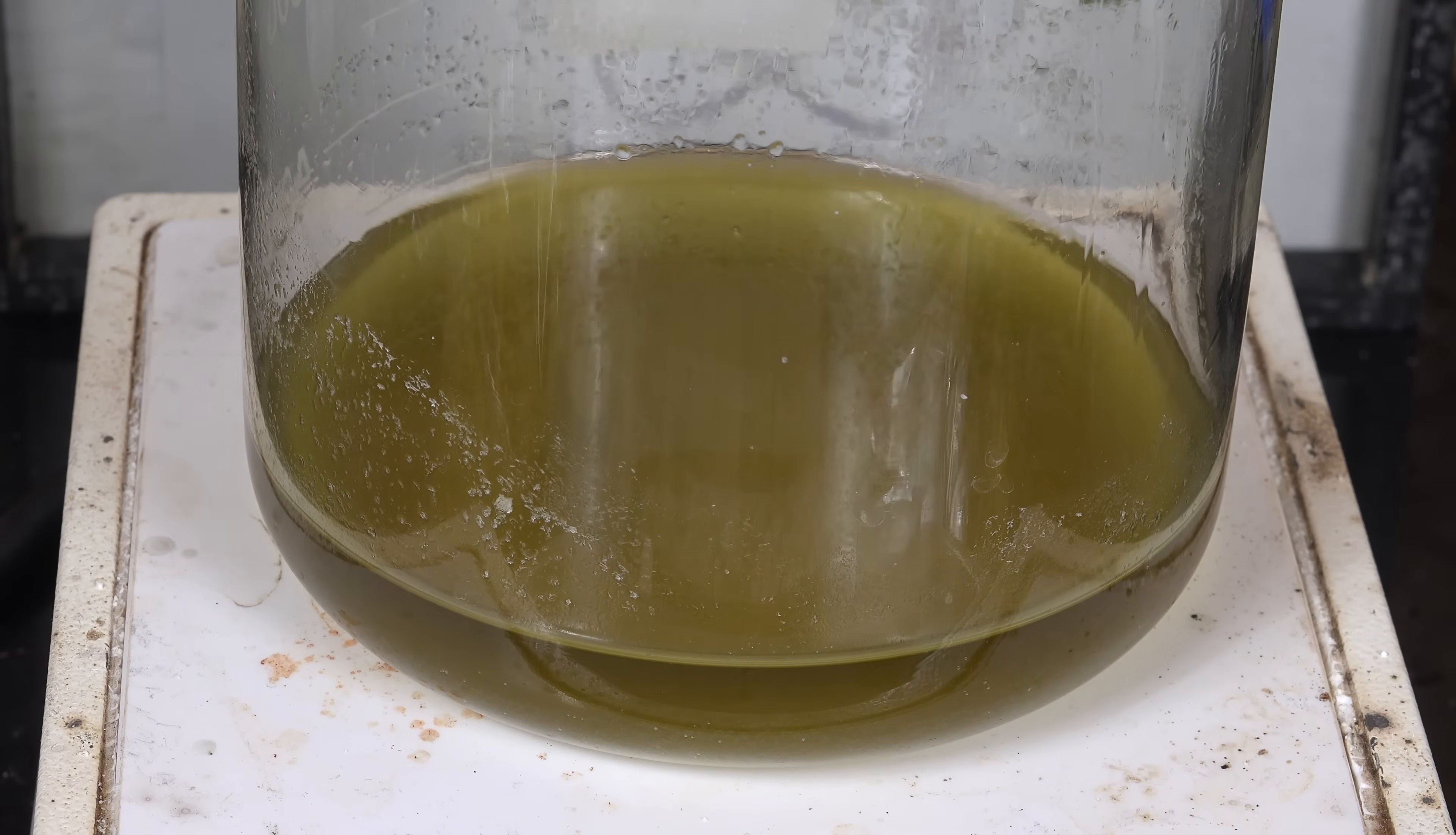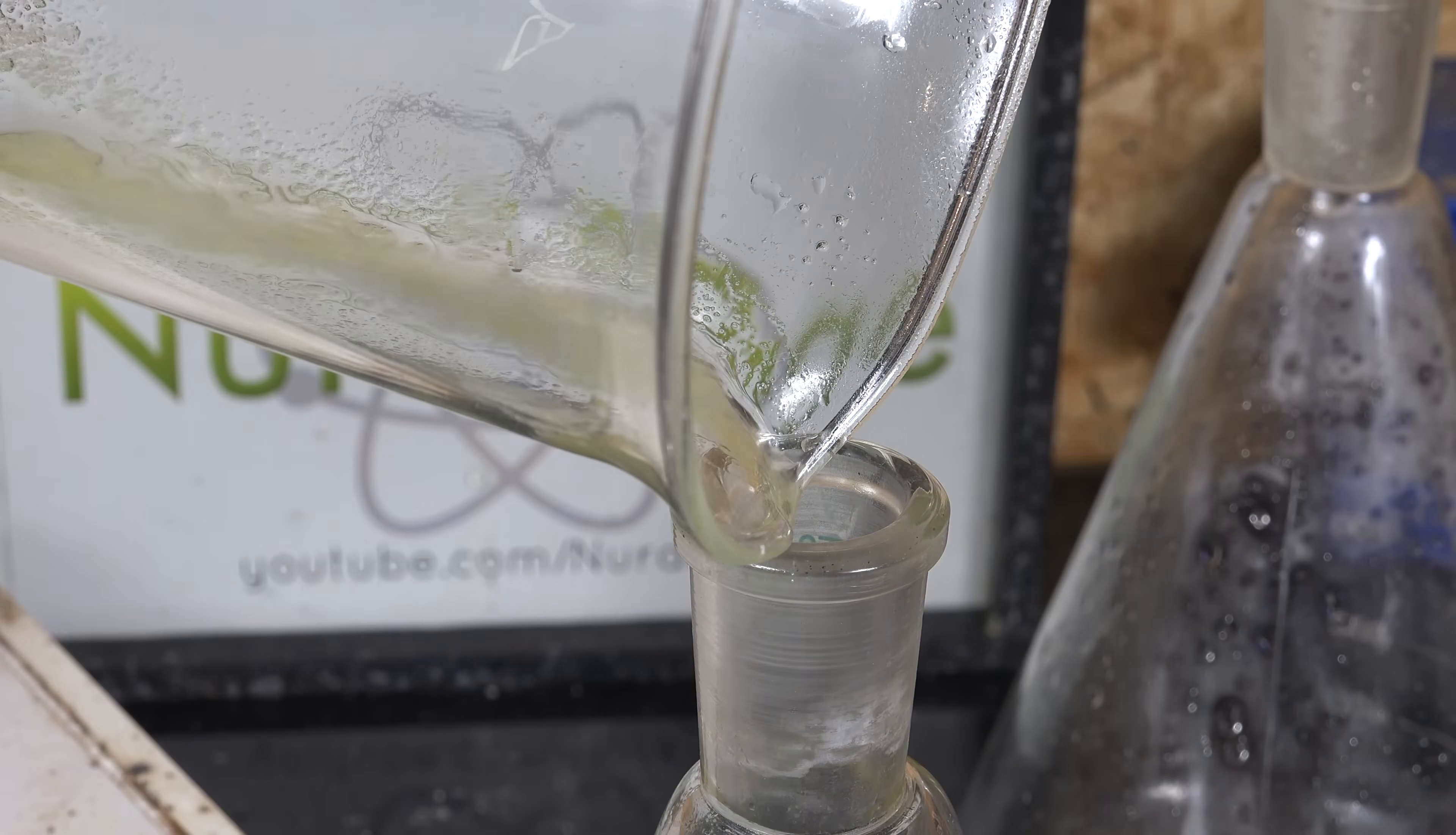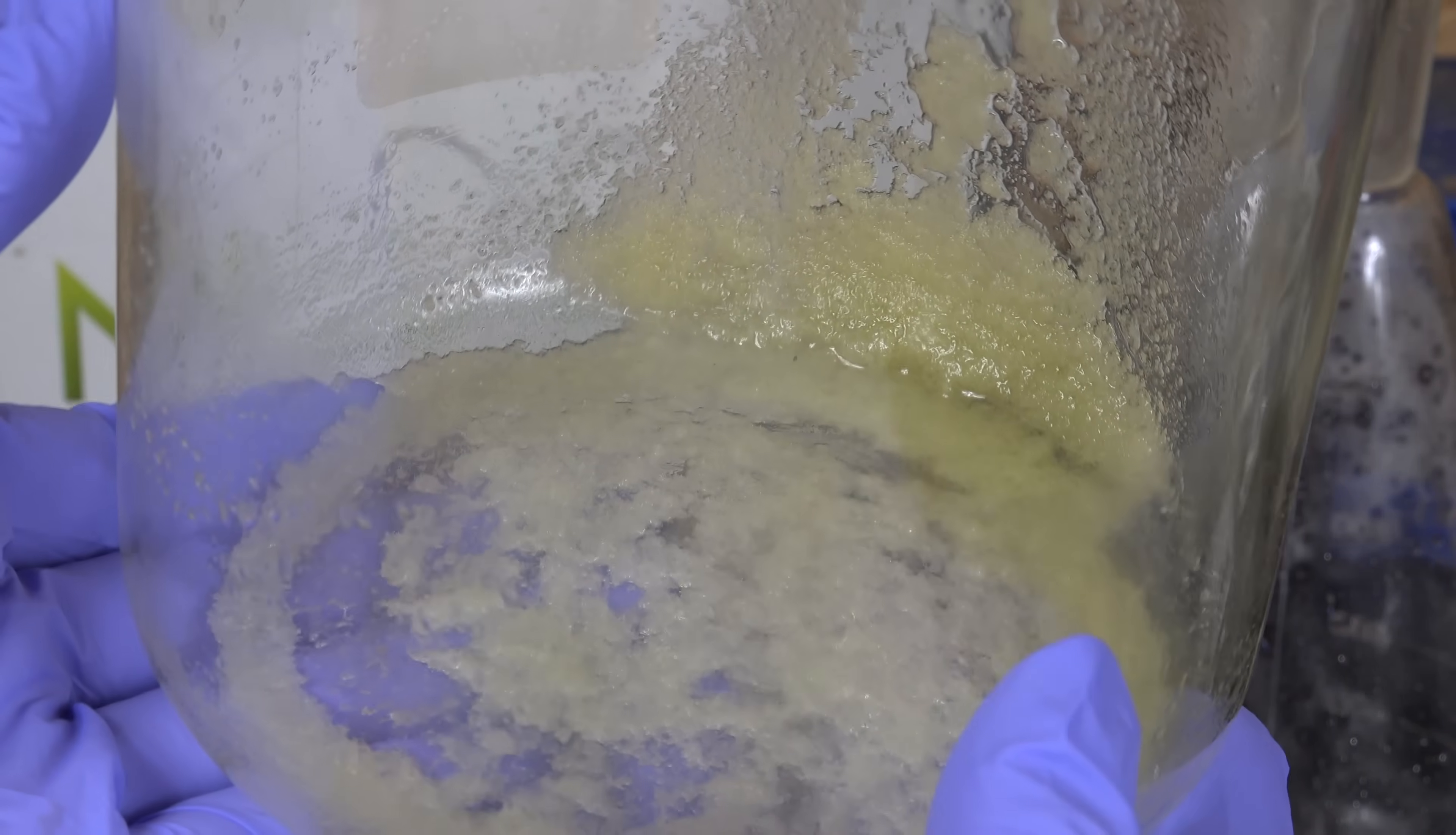The unreacted iron sulfate is much less soluble in the sulfuric acid solution so it crystallizes out. We then decant that into a new flask and you can see here the iron sulfate. We need to remove this so it won't bump when we distill the sulfuric acid.